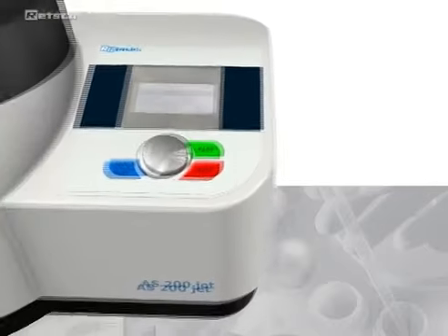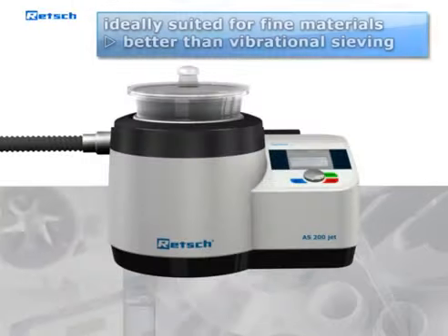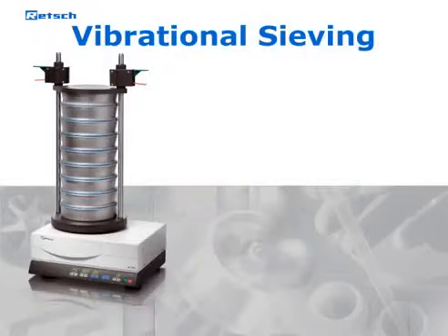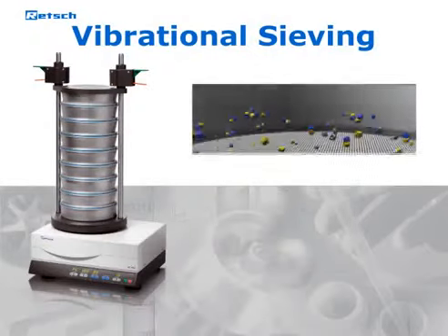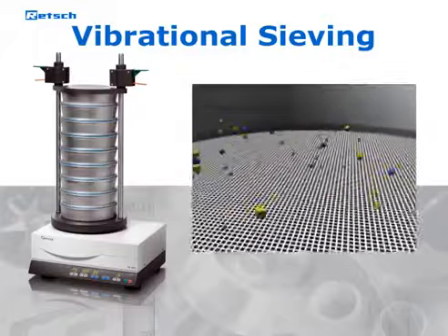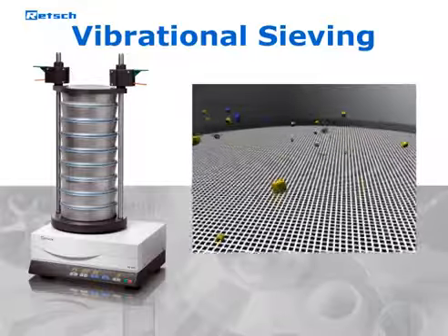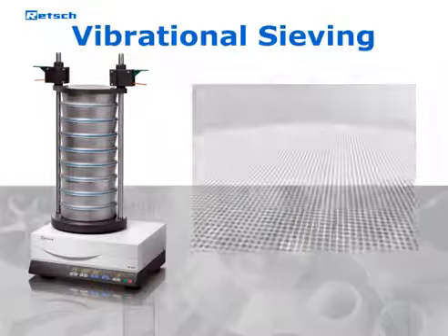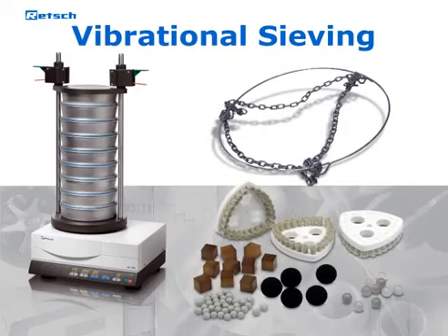The AS200Jet is ideally suited for very fine powders which tend to agglomerate and are only insufficiently separated by vibrational sieving. Traditional vibratory sieve shakers throw the particles upwards, allowing them to change their orientation. Particles which are smaller than the sieve apertures pass the sieve mesh due to their accelerated mass. For breaking up agglomerates, the use of sieving aids such as chain rings or steatite balls is helpful.